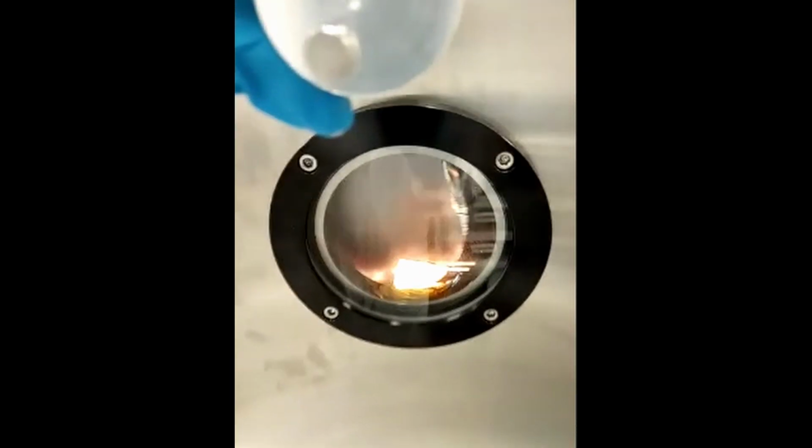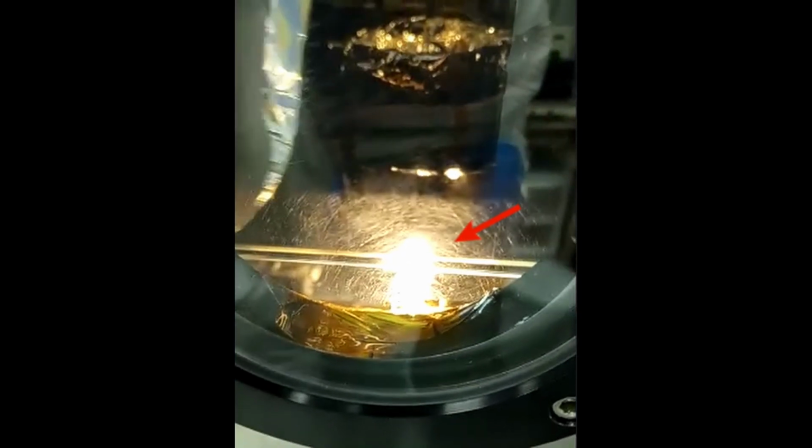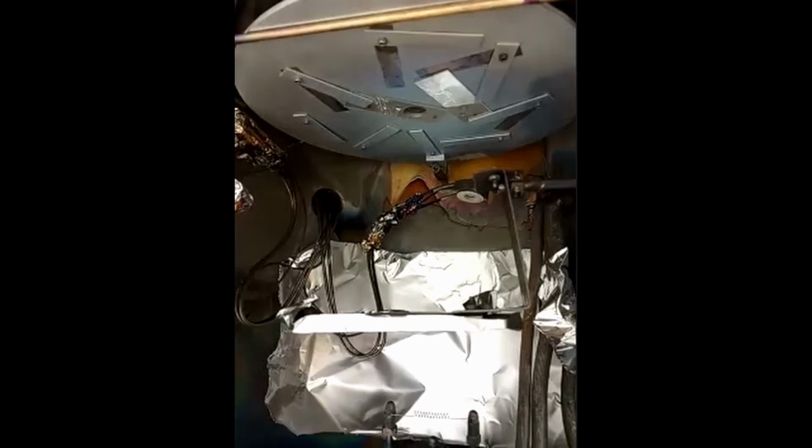So here I can look inside. It's probably going to be too bright. All right, now you can actually see. That's pretty good. The bright light is the filament. The little dot on the top, which is not in focus for some reason, is the titanium pellet. And so we can go and retrieve this TiO2.